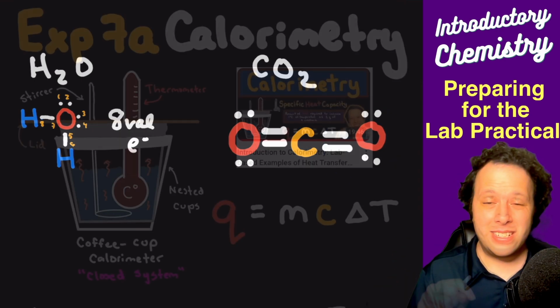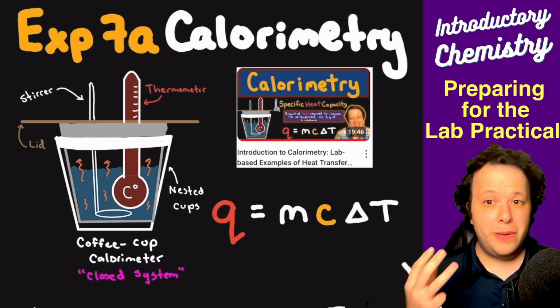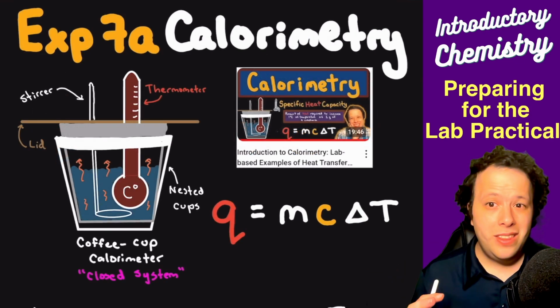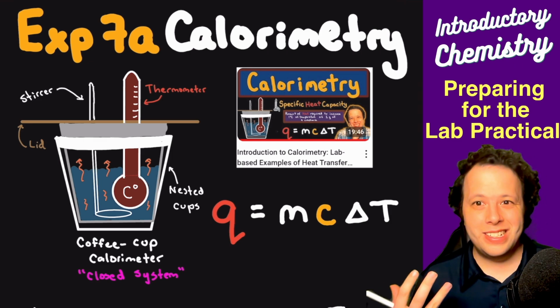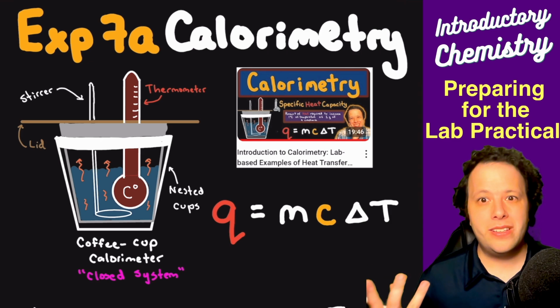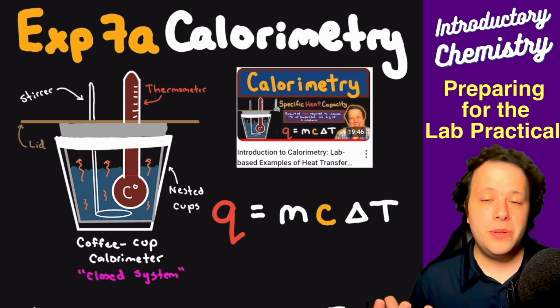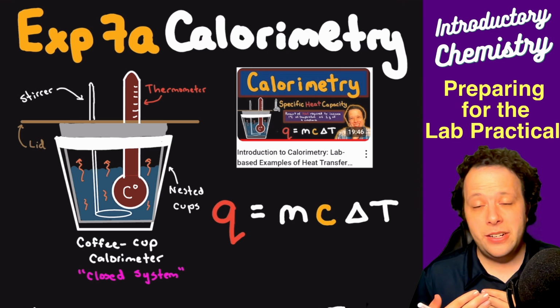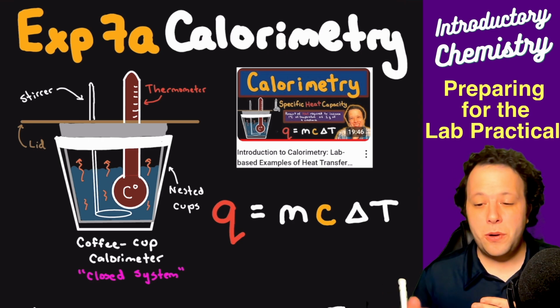Let's look at our next lab. The calorimetry experiment was also a very data-heavy lab, which had a lot of workup. The good thing about the calorimetry lab, I guess, is that it was actually fast. So meaning it's something that is doable within a 5-minute period, because all you were doing was mixing different solutions together and seeing, is there a heat change? So there were a couple different things that were possible.